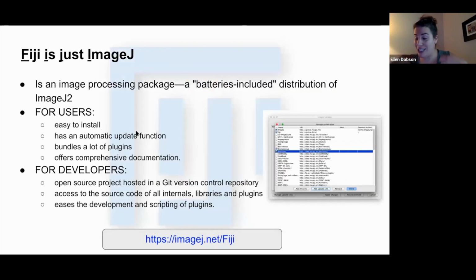So Fiji is, again, a distribution of ImageJ. It really is just ImageJ. That's what it stands for, Fiji. It's essentially just a collection of image analysis tools and plugins that was made specifically for life scientists. So everything we discuss in this workshop and next week's workshop is in the context of this distribution of ImageJ. And Chris, you can download and have the most updated version of Fiji on your systems if you want to play along with what we're doing in the workshops. And again, it has a legacy layer, so everything's backwards compatible.